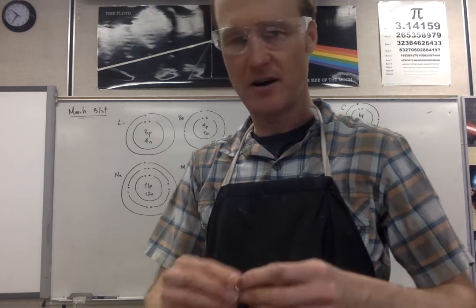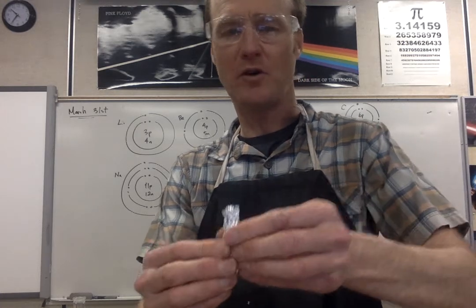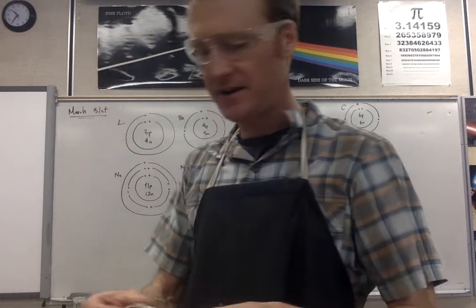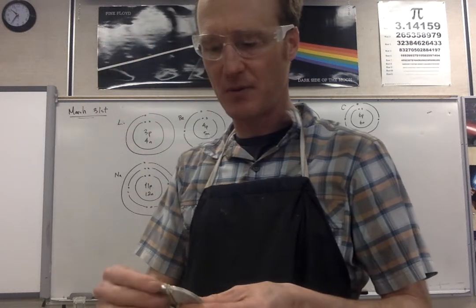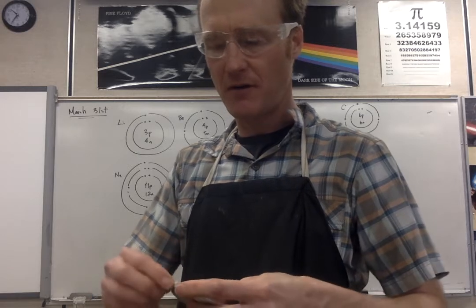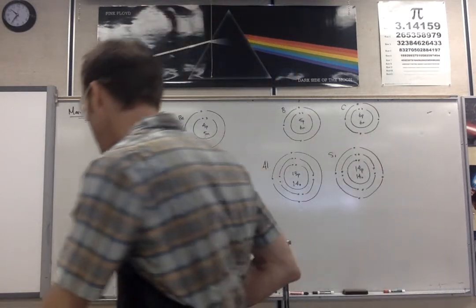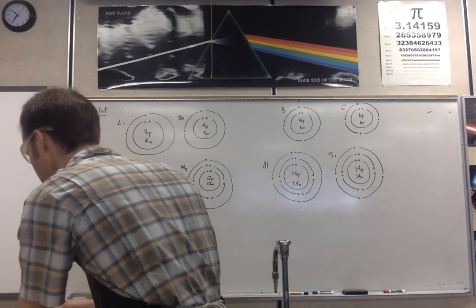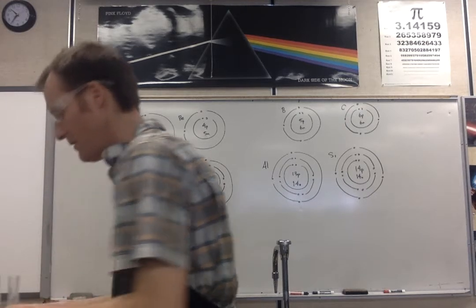So this is our sample of aluminum foil, and here's another sample as well of the magnesium metal strip.